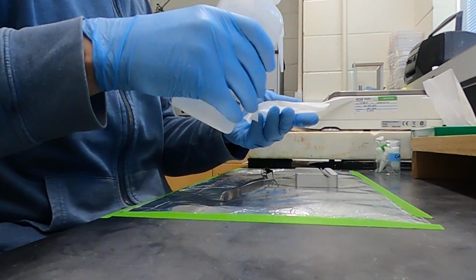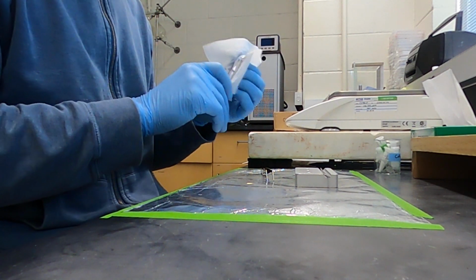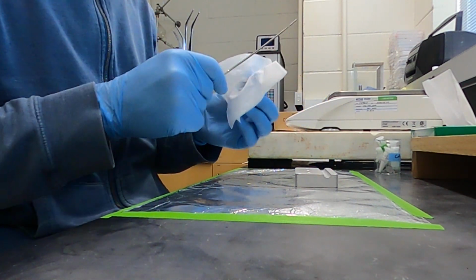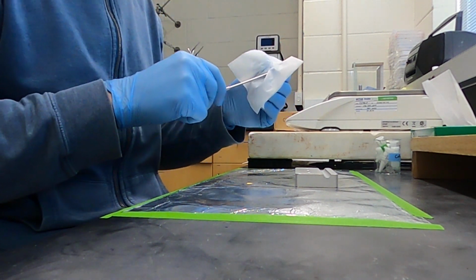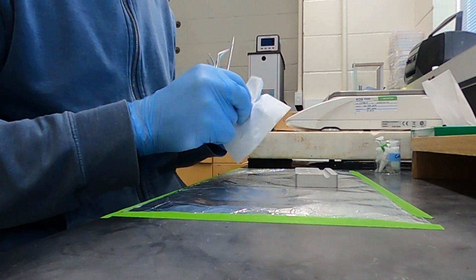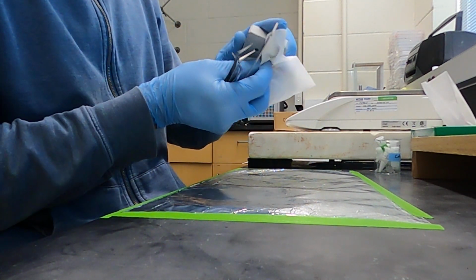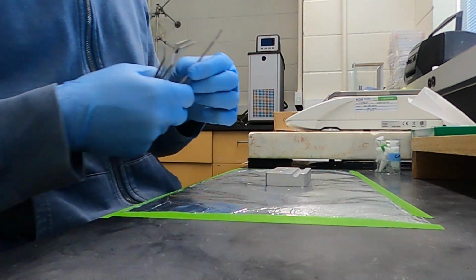So first things first, we can use methanol, it is the best. So I have here a little squirt bottle full of methanol. Now wipe my tools. I mean, they were not dirty to start with, so should be fine. But by precaution, if you don't know if they are clean or not, just clean them by default. And then also the little table we're gonna work on, and that.